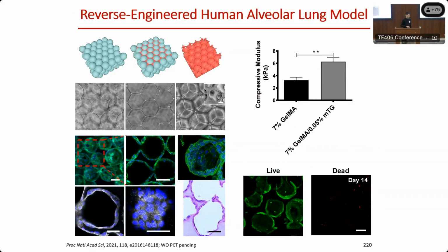We showed that these cells nicely express biomarkers, for example ZO1, the junction protein, between the cells. In the cross-sectional view, standing at the bottom right, you see the epithelial cells form a very nice single-layer lining along the wall, and also the windows connecting the different pores. If you culture these cells in the scaffolds, they stay alive, in this case, up to 2 weeks. But in actual experiments, we show you can culture this for up to months without many dead cells in the system.